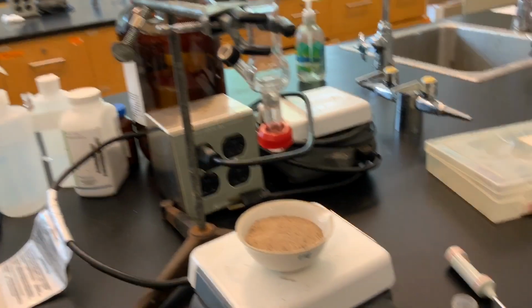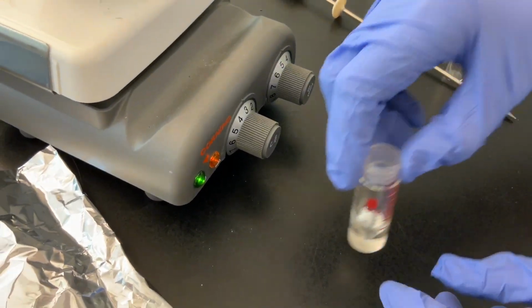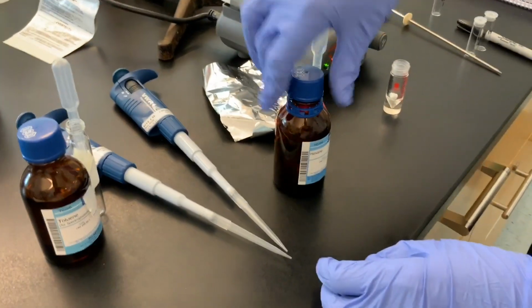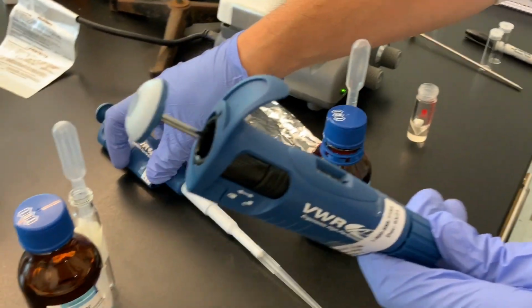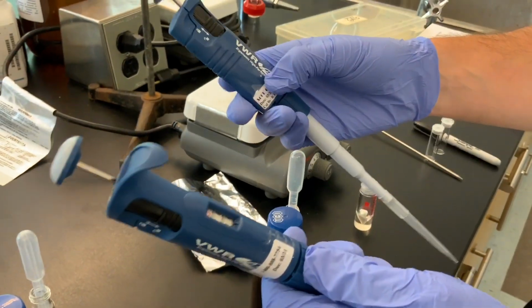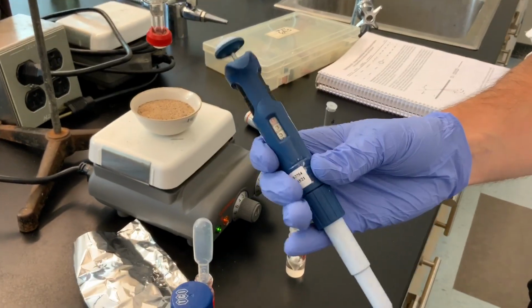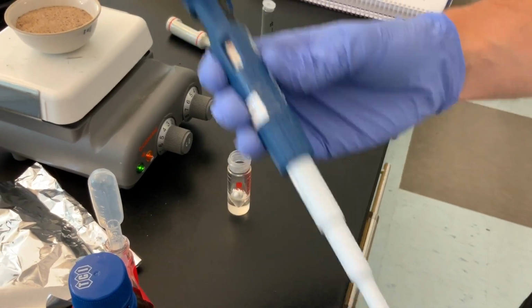Okay, let's hope that this goes well. So I've got my spin vane in my 5 milliliter reaction vial, and now I'm going to combine our two liquids. I want to be sure that I'm using different automatic pipettes, and the first thing you want to be sure of is that you're actually going to add 1 milliliter.